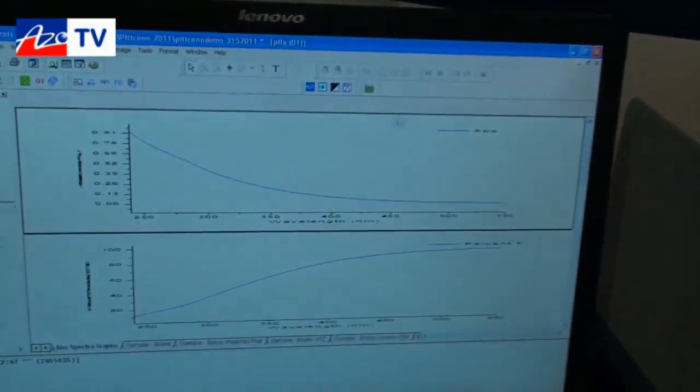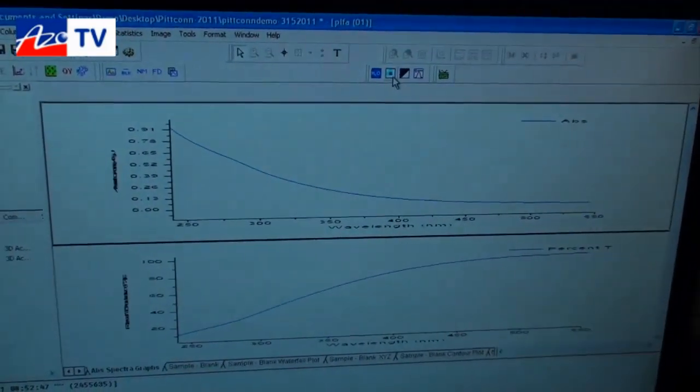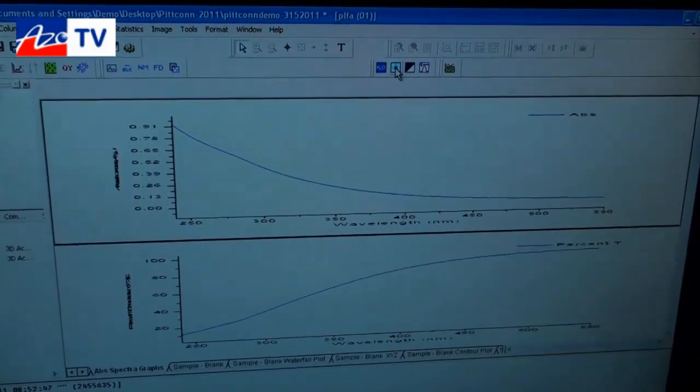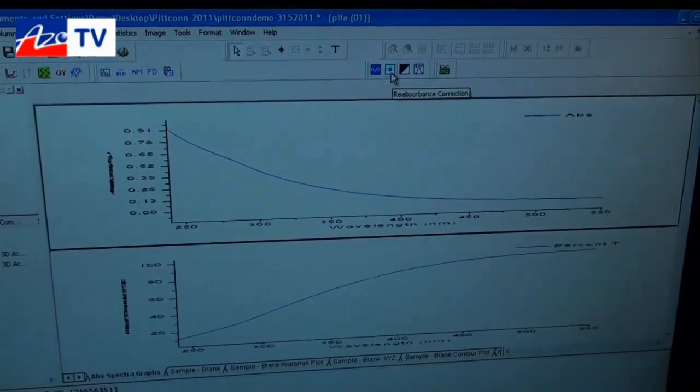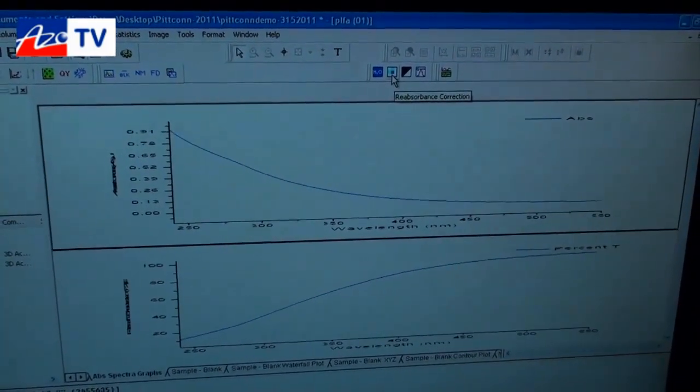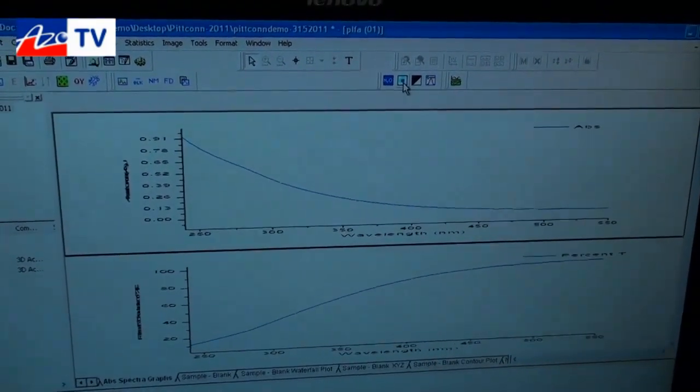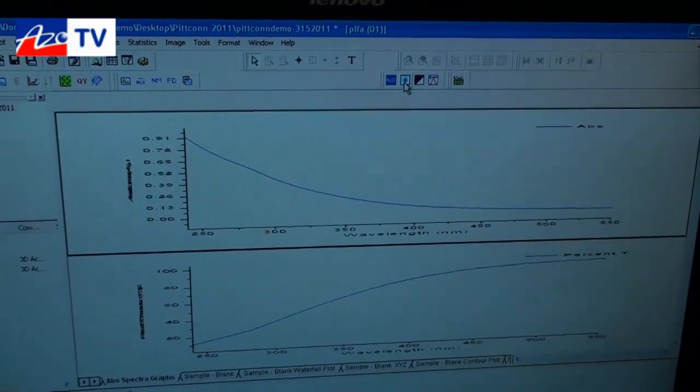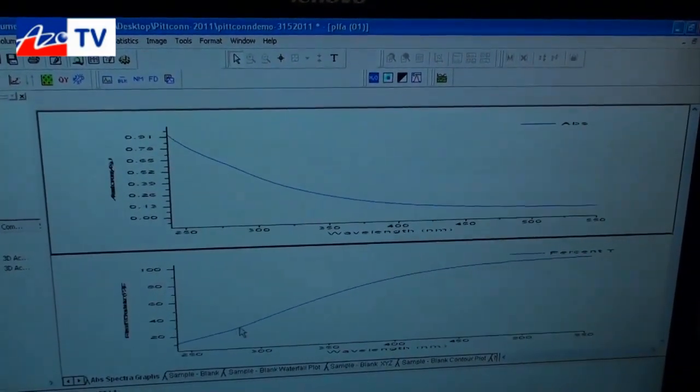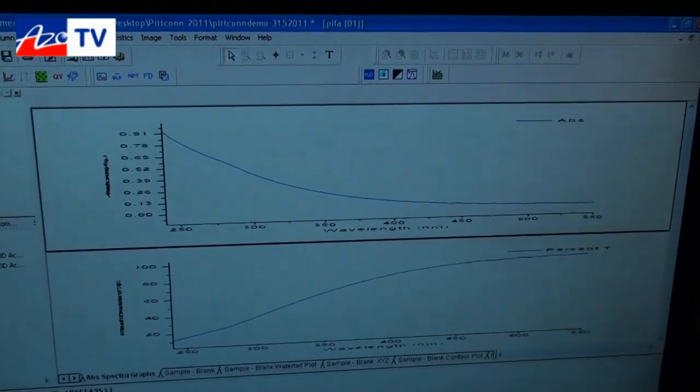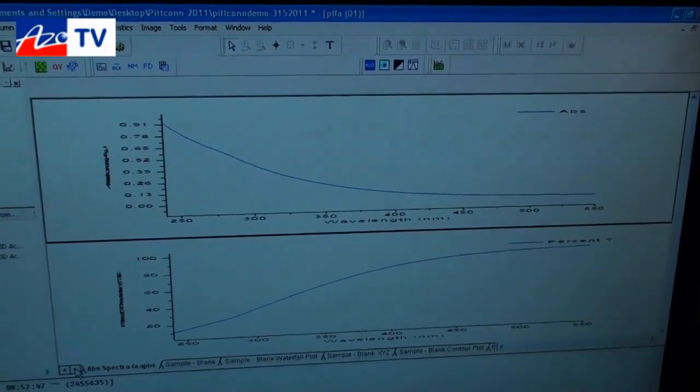So we have a special algorithm for this instrument called the reabsorption correction and what you'll see here is the button that we use to activate that tool. What that does is it corrects the fluorescence with the excitation spectrum to yield an undistorted fluorescence spectrum.